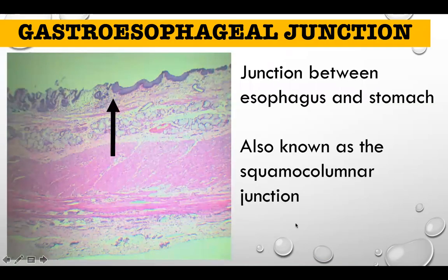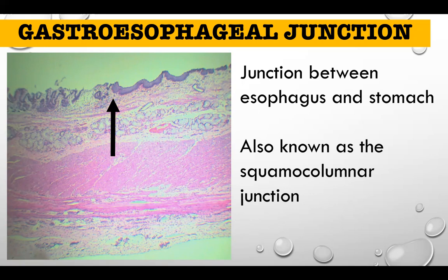This picture shows the gastroesophageal junction. The pointed area is the gastroesophageal junction because on one side the epithelium is stratified squamous non-cornified epithelium — that is the esophagus — while on the other side it becomes simple columnar epithelium, which is the stomach. This is also called the squamous columnar junction, but do not use that term here, as there is also a squamous columnar junction at the lower end of the digestive tract.